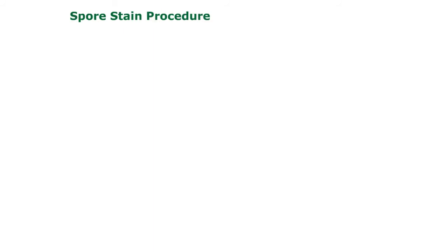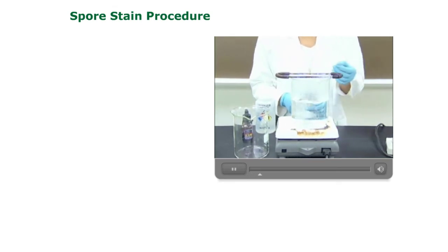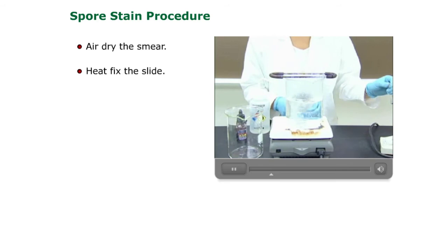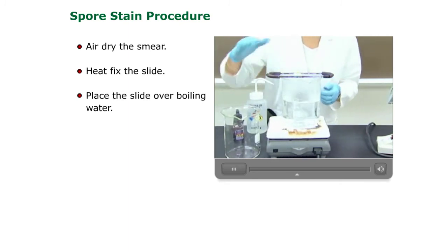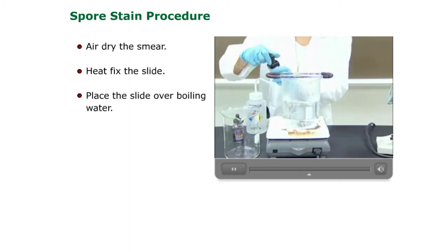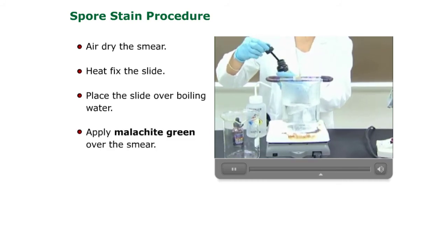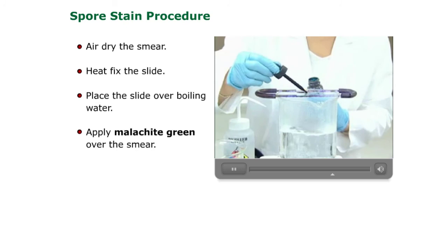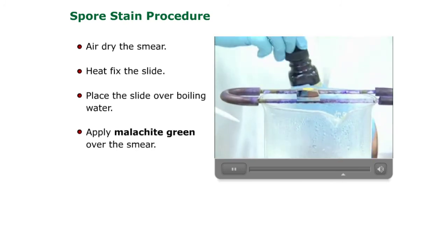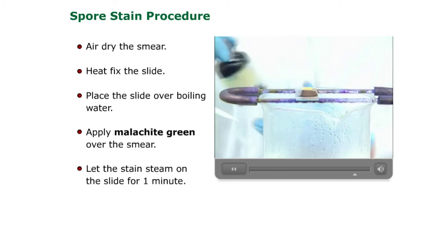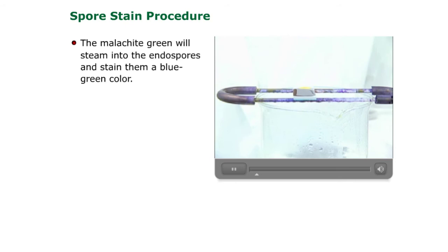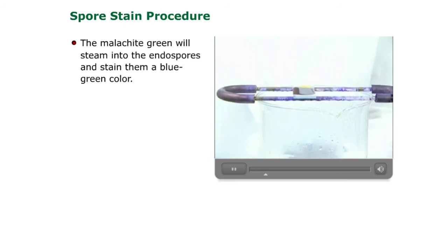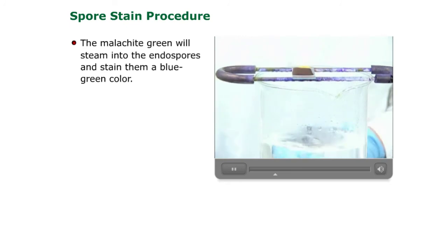Let's watch the spore stain procedure. The first step in the endospore stain is to make the smear, air dry, and heat fix the slide. You place the slide over steaming water, and then you put malachite green on the smear, right over where your smear is on the slide. Leave the malachite green on the slide to steam for one minute. The malachite green will steam into the endospores and stain them a blue-green color.